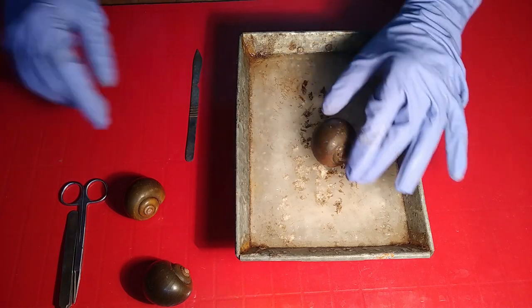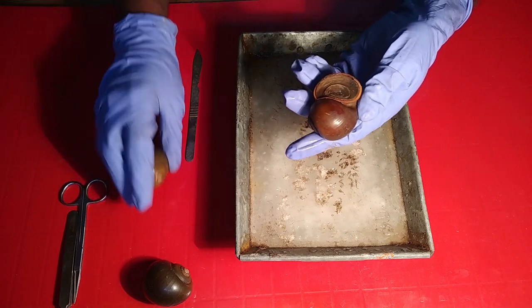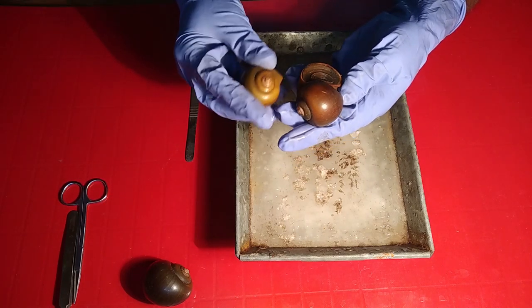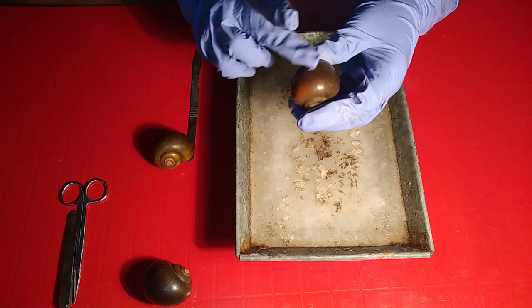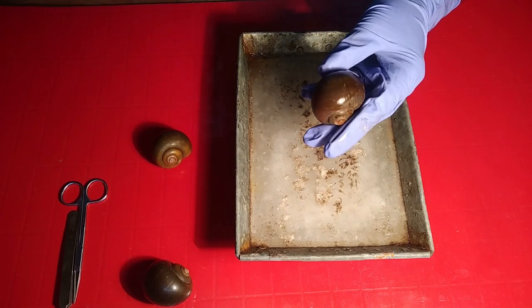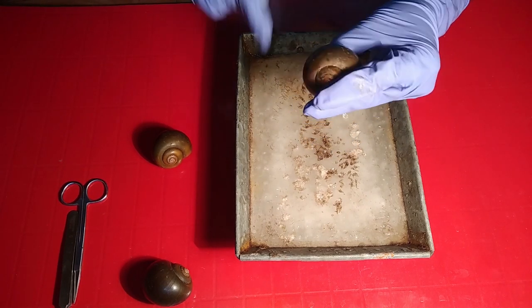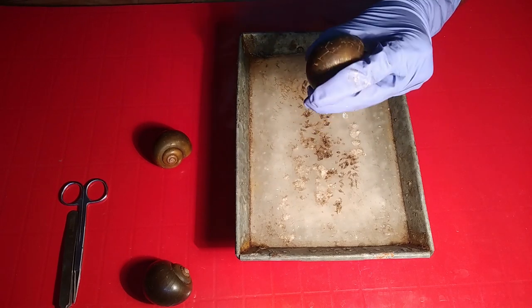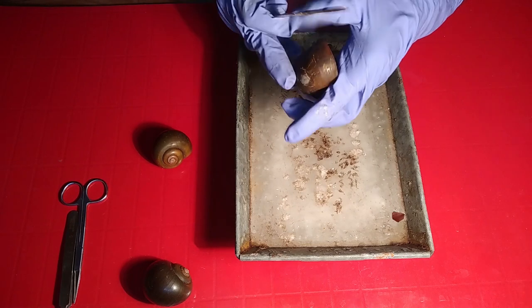Welcome to Jubangla. In this video we'll try to have a session with this mollusk. There are so many questions regarding how to open the shell and how the mollusk looks under the shell. They are soft-bodied, unsegmented animals. First of all, we are trying to remove some shell portions with this scalpel.